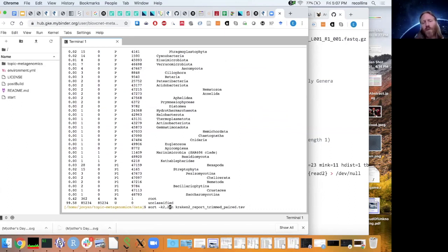And so in Bash, we'll use the sort command. K means the key that we're going to use, and so that's column 2 and only column 2, that's the comma 2. We're going to sort in reverse, that's R, so it'll use higher numbers first, and N means numeric, so we're going to look at the numbers and not the ASCII character code to sort them.